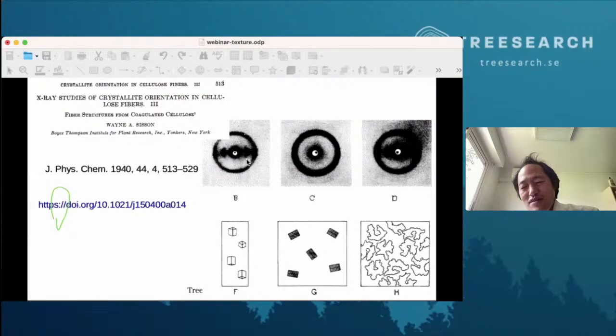So this is directly related to the behavior of cellophane, because cellophane swells a lot in water, but only in the thickness direction. That's exactly because the water will penetrate only in the direction where you have hydroxyl groups, which is perpendicular to the film. And this simple photograph illustrates this directly. This peak, which is at smaller distance from the center, means that you have larger spacing. Okay, and this is the spacing between hydrophobically stacked antiparallel cellulose sheets. And water can more or less penetrate inside, because if you have a wet sample before completely drying, you see this peak is at lower angle, and when you dry, it appears stronger and at higher angle.